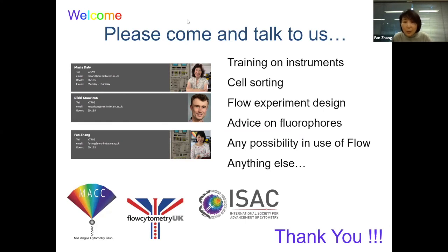Okay, so I have one question. How does the software calculate compensation? Compensation is an algorithm, a mathematical calculation. When you run your single color control, the software can assess the percentage of the spillover from one channel to the other.